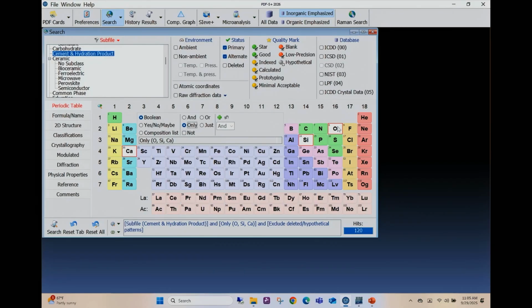All right. And I'm specifically interested in a specific calcium silicate. The cement people like to use these letters with numbers. So there's one called C2S. It's not a dicarbon sulfide. It's 2 calciums, a silicon, and then the appropriate oxygen to go with it.